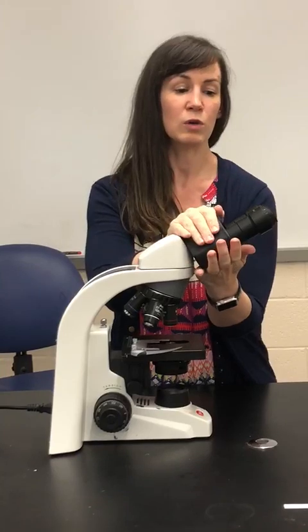And when you're looking through a microscope, you want to try to move these to where you can actually look through both eyes at the same time. That'll let you get the best view and the most accurate view of what it is that you're looking at under the microscope, what your specimen is.